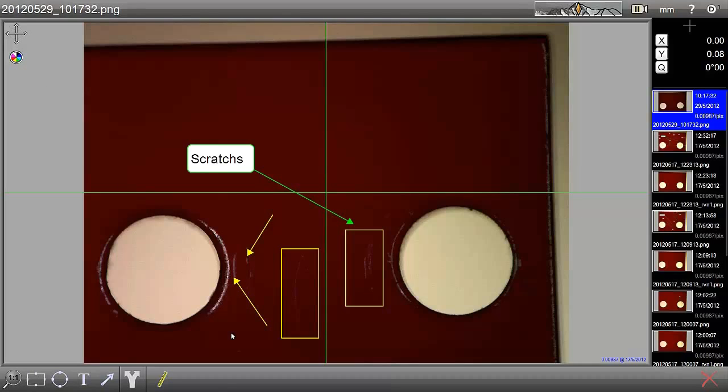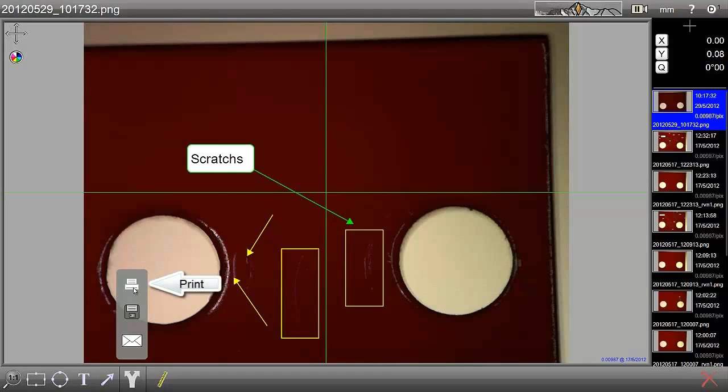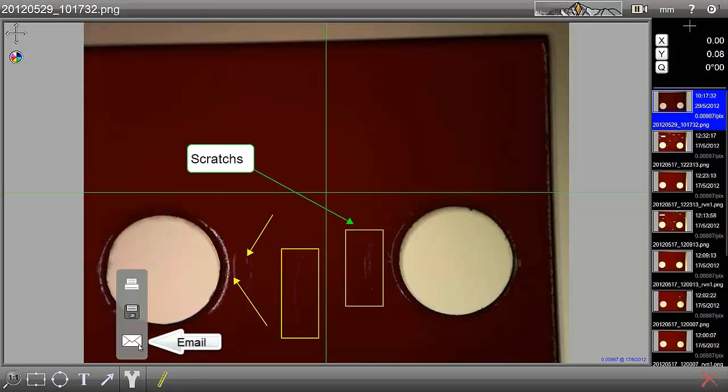Once we've done that and we've made all the markups or annotations that we'd like to do, we can use this key here. This allows us to either print out to a printer or maybe save it as a JPEG, a bitmap or a PNG file. Or finally, we can just email it to somebody.